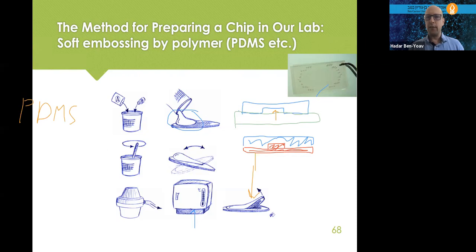Okay, any questions on soft lithography or how to make photoresist? How to make channels?